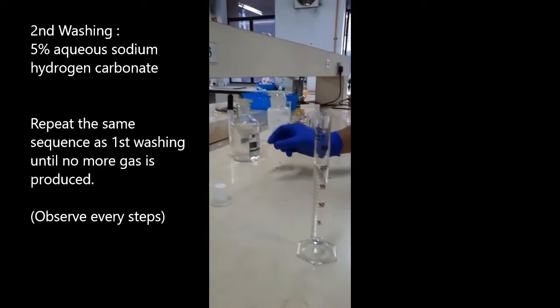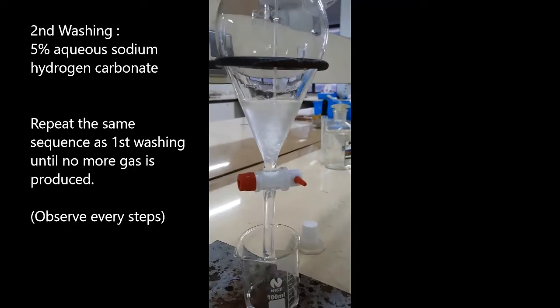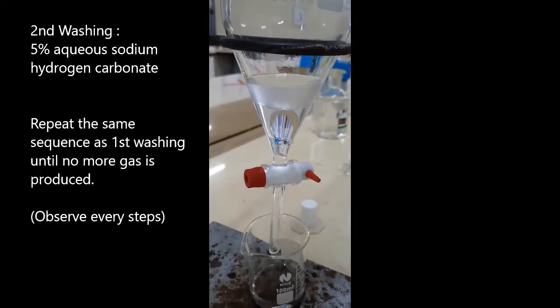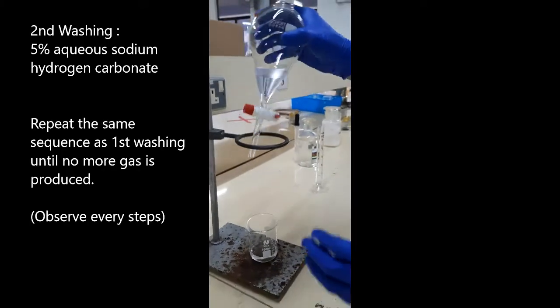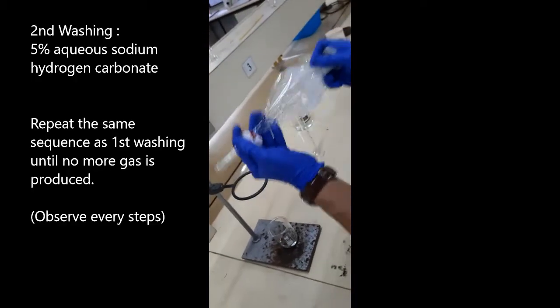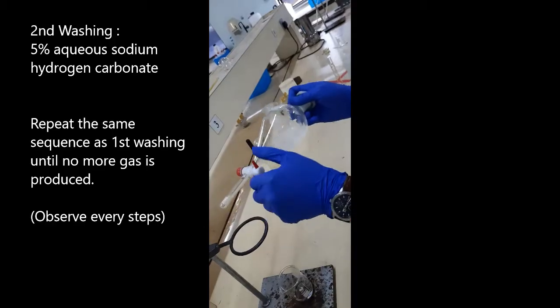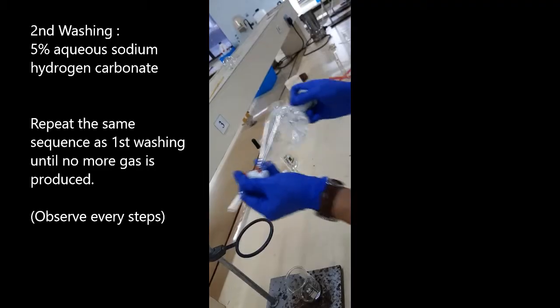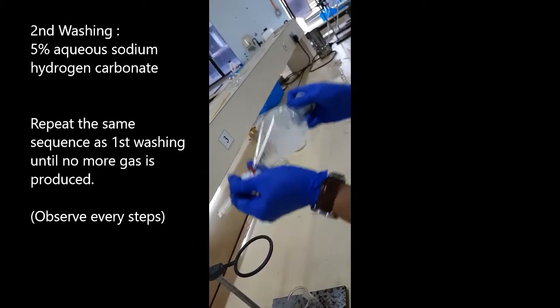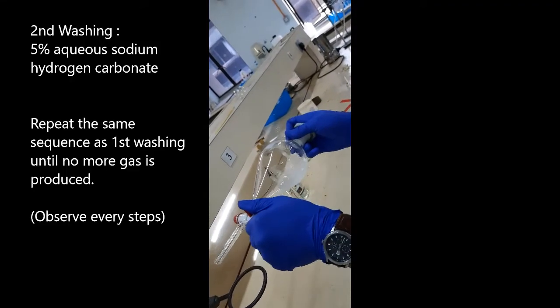Measure the amount of solution needed. Add the solution into the separating funnel and shake. Observe the formation of two layers. Repeat the shaking and depressurization cycles until the liberation of gas stops.